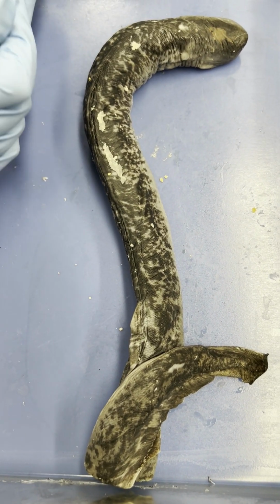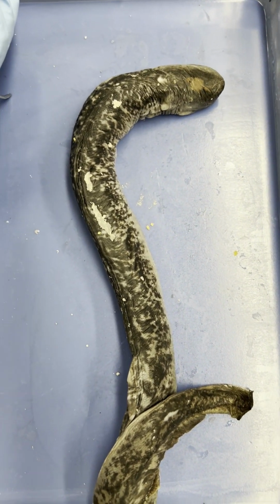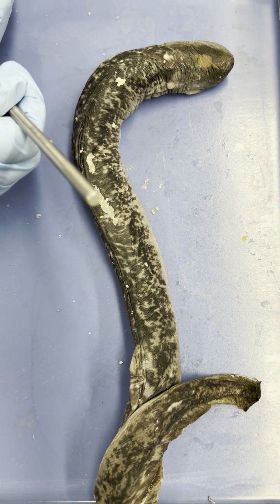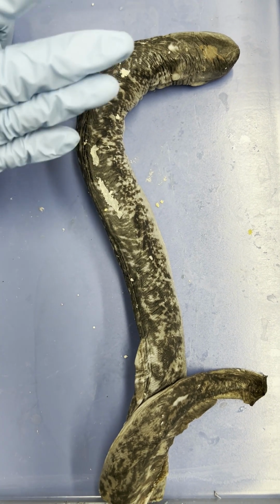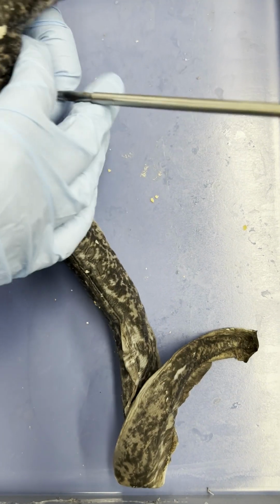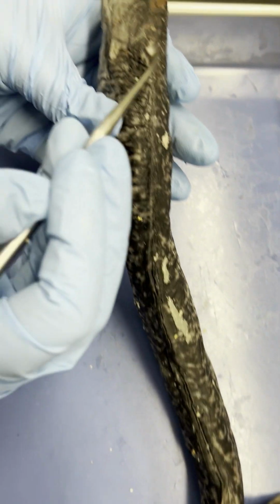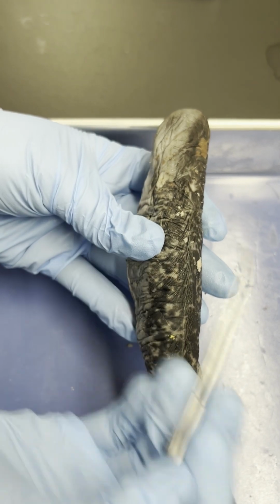So on page 22 of your lab manual, we see an area that talks about the cross sections that you're going to do. So we're going to make 4, as I said earlier. One cross section is going to be through the pineal organ and the eyes. So we'll do that in a minute.